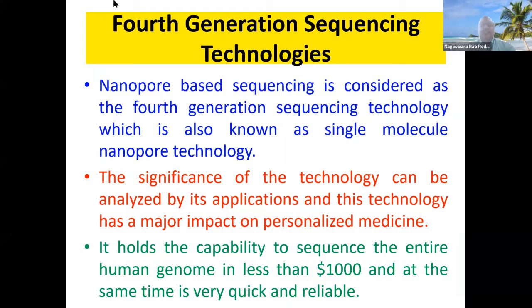Now we'll see here the fourth generation sequencing technology. Nanopore based sequencing is actually considered the fourth generation sequencing technology. It's also known as single molecule nanopore technology.